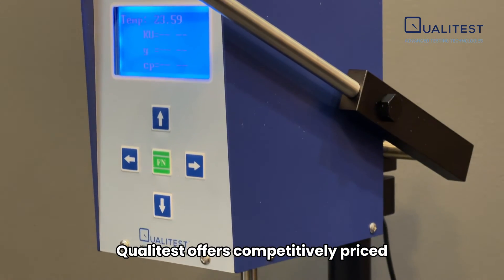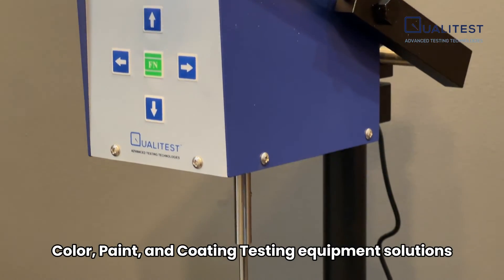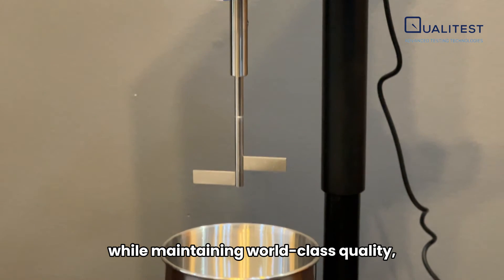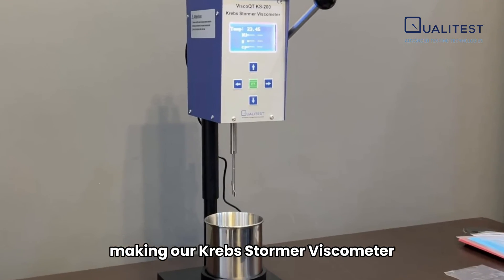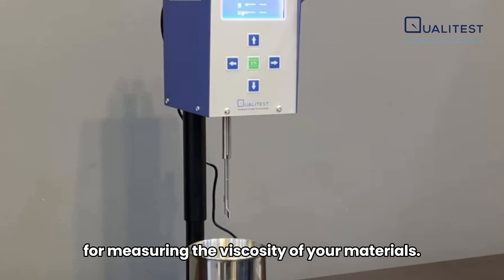Qualitest offers competitively priced color, paint, and coating testing equipment solutions while maintaining world-class quality, making our Krebs Stormer Viscometer an ideal choice for measuring the viscosity of your materials.